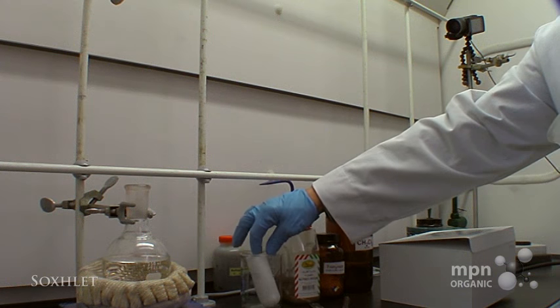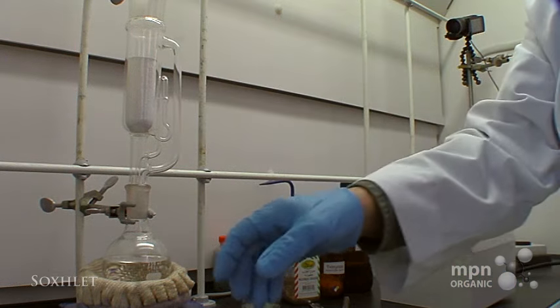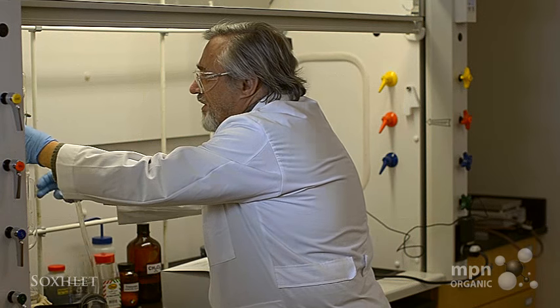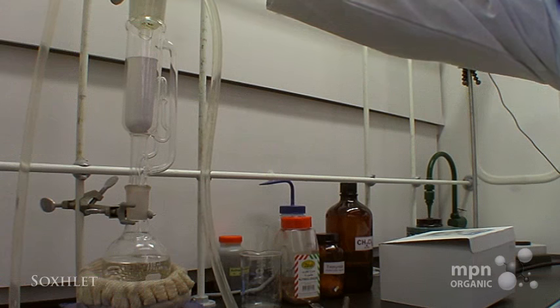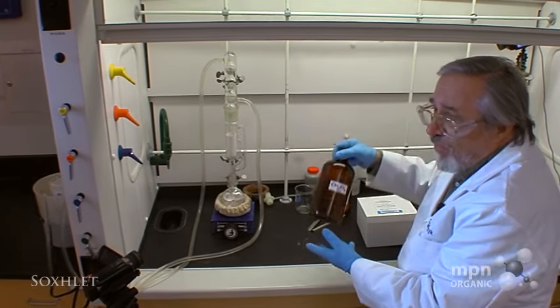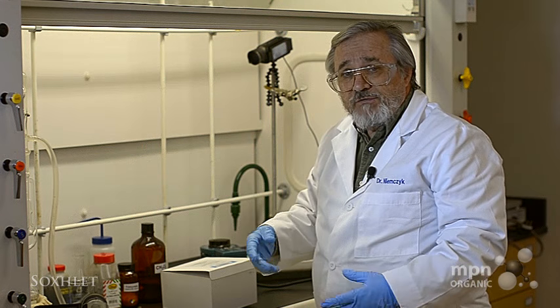I measured about 12 grams of the ground nutmeg into one of these thimbles, and that's going to go in there like that. I'm going to put this apparatus together. I've taken the leads from the condenser, which fits the top, and led them into a chilled water circulator outside the hood, because methylene chloride itself boils at about 42 degrees — which is 5 degrees above body temperature — so you have to make sure that you condense it effectively.